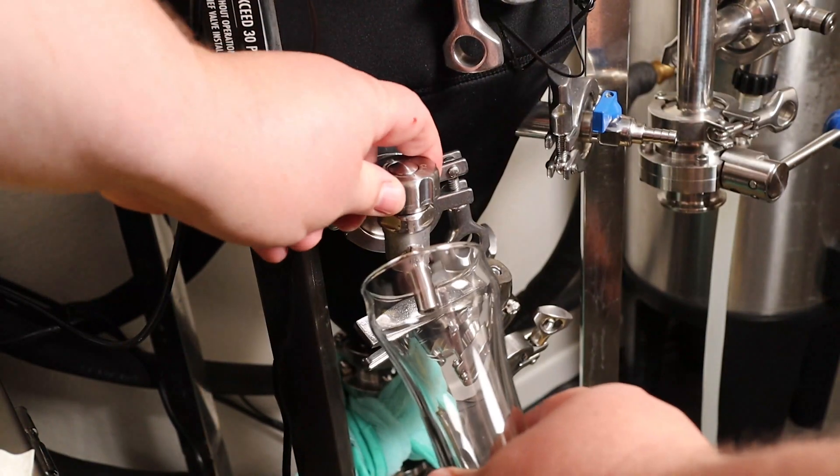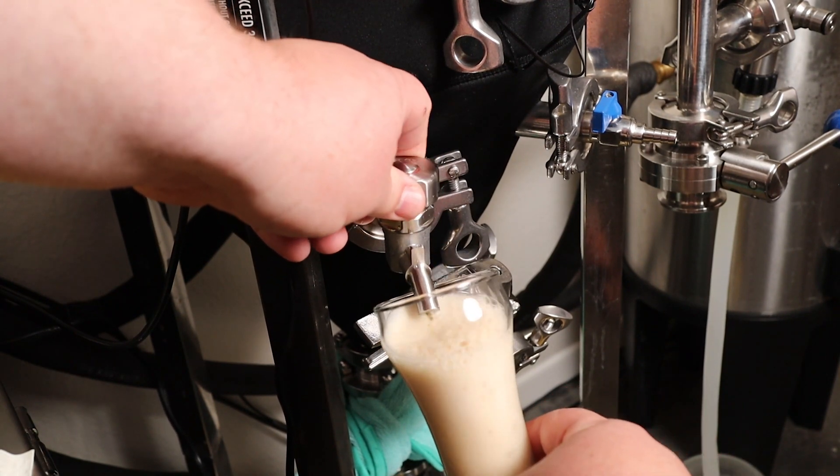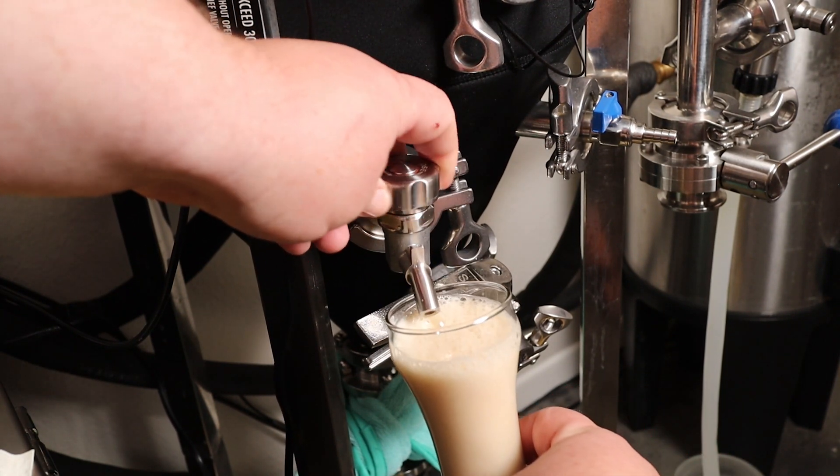Next off, we're going to take a sample right off one of my unitanks. It's about ready to cold crash — it should be done. Not using a sampling coil because I need to degas the sample, and I feel like this helps degas it sooner. Who knows?